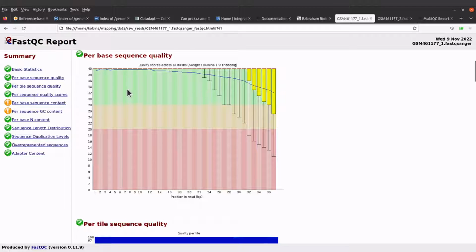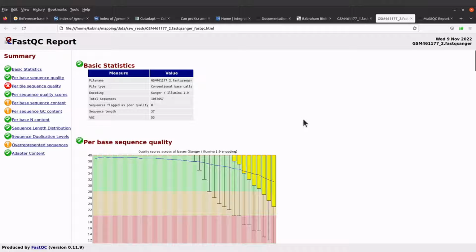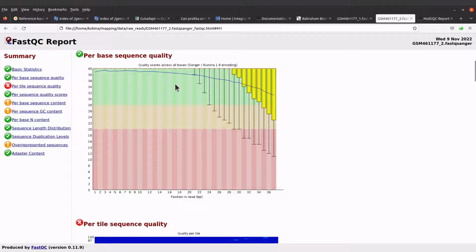You may be expecting some of the box and whisker plots here. Like you may want to see them here, but then they are all clustered here. This is because we are not using the entire data set. So the one that we are using is what has been shown here, and the scores are quite high, so that means that they have good quality. Let's also look at the reverse. We also see that the scores are high, but some of them are in this region, but in general the scores are quite good.